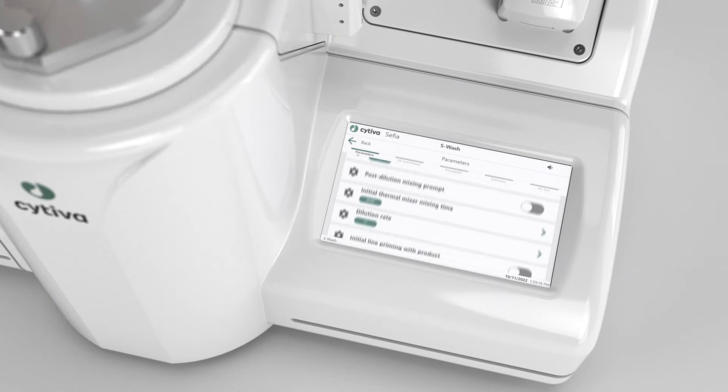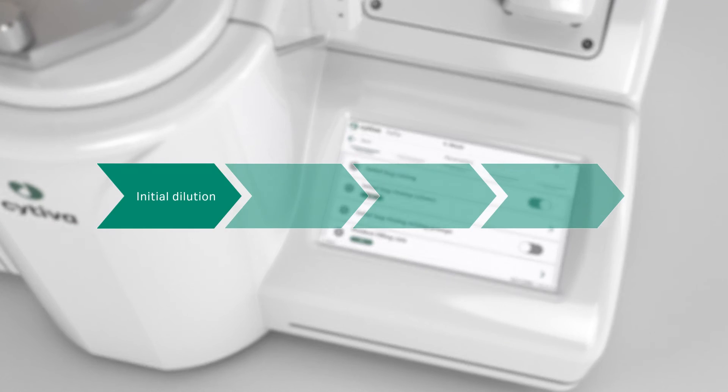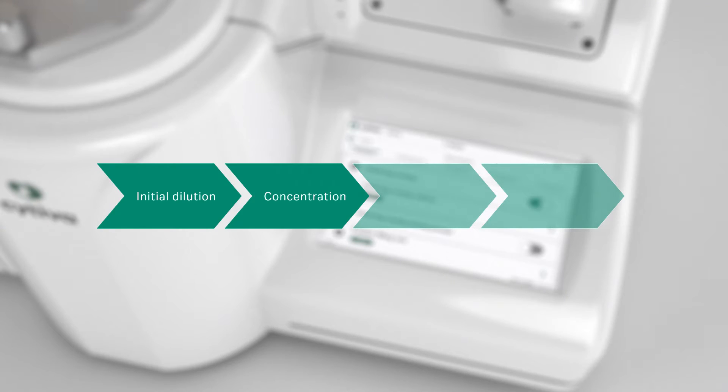Experience flexibility through the system's user-definable parameters and steps, including initial dilution, concentration, washing, and resuspension.